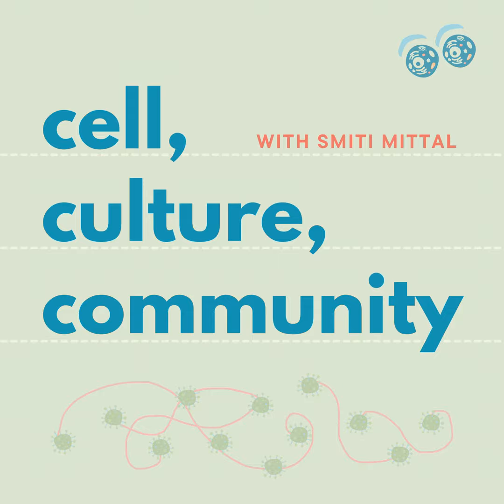If you want to do that, you have to imagine that when you put the blood, it will spread on any sort of platform. And if you have your reagent stored at a certain place where you want the blood to react, and your spectroscopic exam is focusing on that, the blood has to go to that place. So in the lab, you use a pump to pump the blood through a channel. In a resource-poor setting, you would not like to use any electrical power or a pumping device, because these are auxiliary devices. They require maintenance, not just cost. It is an inconvenience in terms of availability of resources.